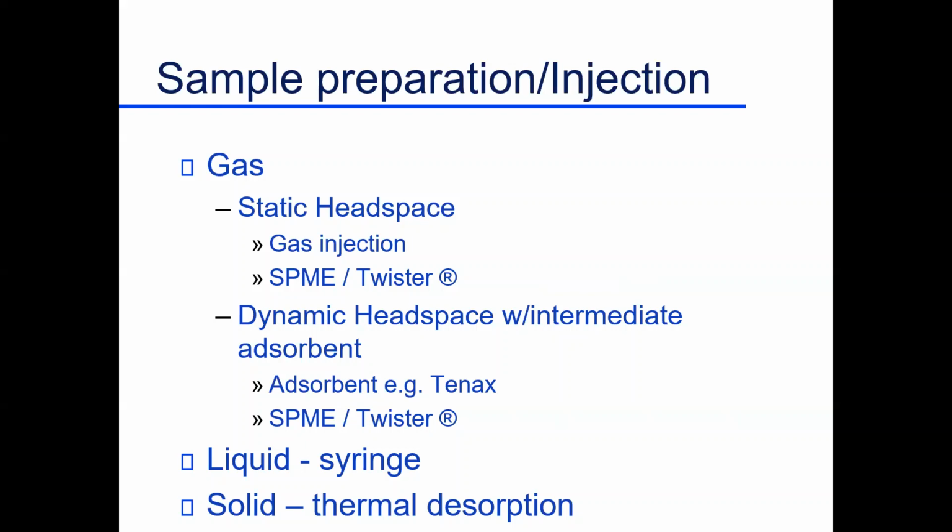But there are alternatives. There are two techniques called SPME, the solid phase microextraction, or there's a stir bar. I think we'll see all of these methodologies, so we won't go into what they are right now. But you can use this to concentrate your headspace. By SPME, you can take whatever compounds are in that headspace and concentrate on those. This is not very concentrated, but this concentrates that headspace.